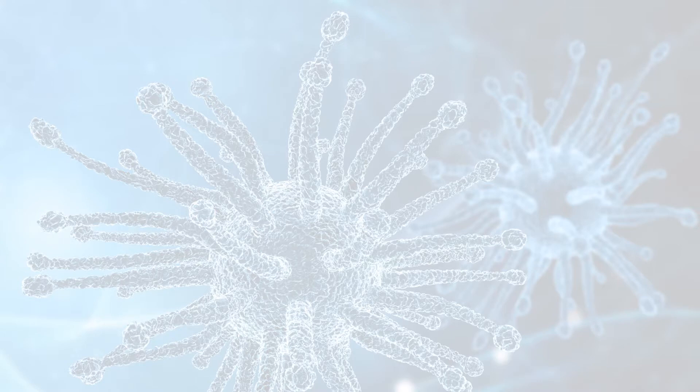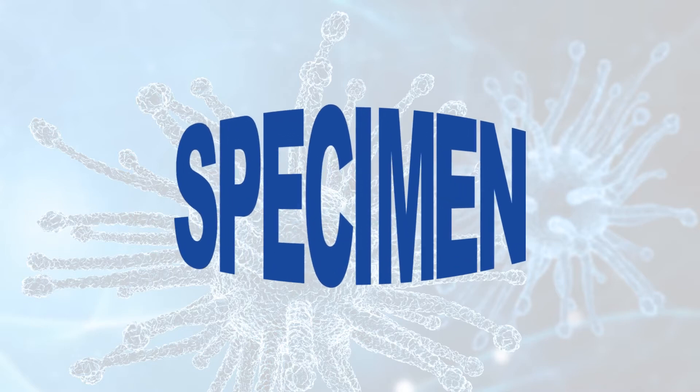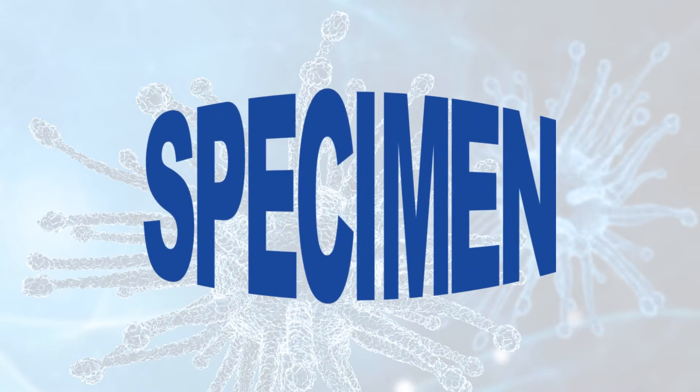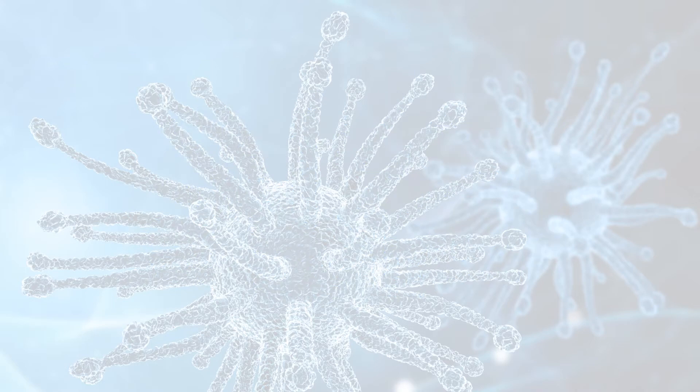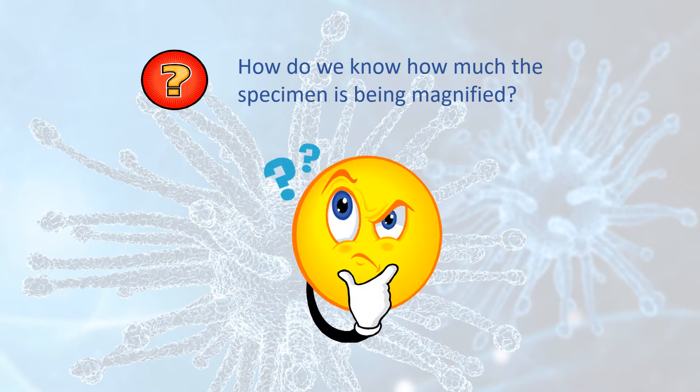When using a microscope to look at a specimen, the image we see makes the specimen look much larger than it actually is. I mean, that's the whole point of using a microscope, isn't it? But as scientists, we always want to have an accurate view of the world, so it's helpful for us to know how much a specimen has been magnified. If we know that, we can get a sense of how big the specimen actually is in real life.